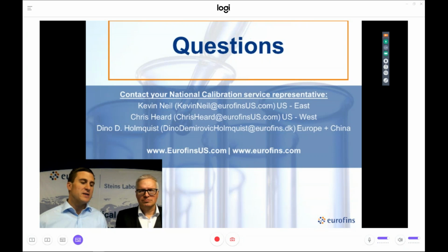One thing I should mention is also that it is very good to look at the matrix that you are eventually producing or taking in at the dairy plant. That could also be goat milk, which could be very useful to calibrate with. And the same with the finished products. If you have some very special finished products, then you should also aim to have calibration standards which are as similar as possible to the finished products, because the IR spectra will reveal whether the product is original or not. So that's a very important thing to consider, how to build up your calibration standards based on the product that I actually want to measure at the instrument.